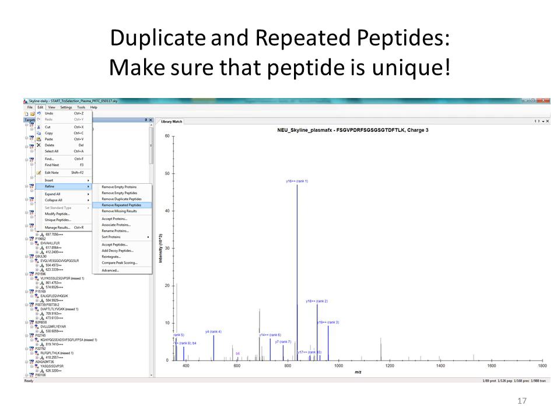So duplicate transitions, this has a lot of different ways to explain it, or the terms. But, well, peptides first. When you take your spectral library and decide to target a list of peptides, I don't know why I always tend to mess this up, but when I make a spectral library database in Skyline and then add a list of peptides, I always have 2 of the same peptide somewhere on my list. And I have hundreds of peptides, and I can't scroll through each one and delete.